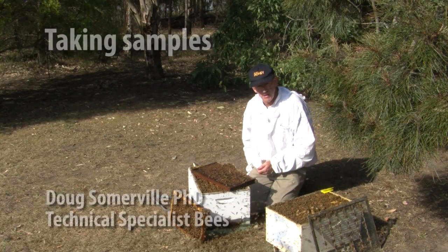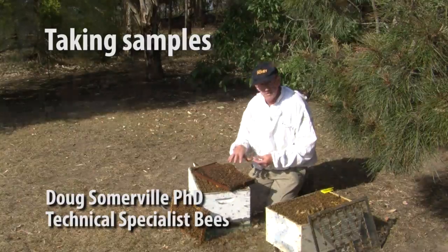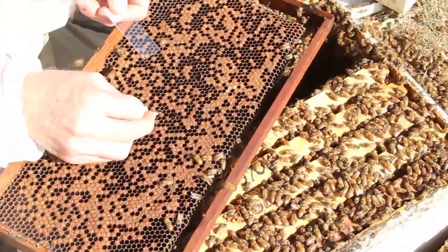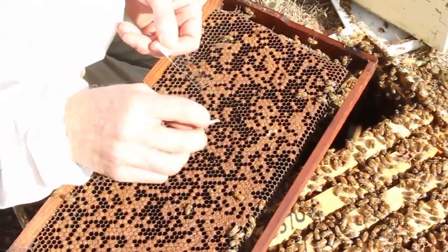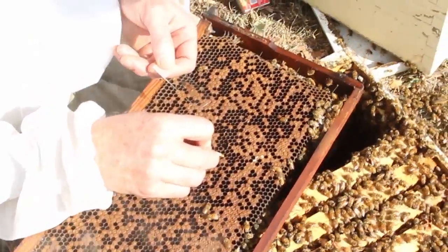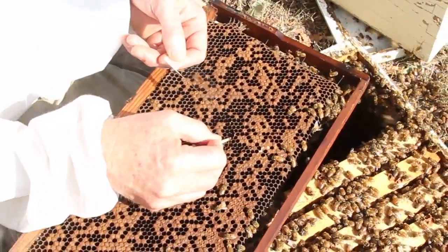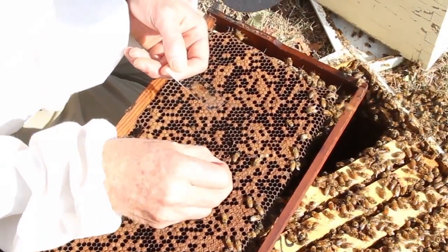We've found something suspicious in a beehive. What we need to do is ascertain whether it actually is American foulbrood, or it could be European foulbrood, or it could be a virus. One of the methods of doing that is to take a smear sample or a smear slide, and we get three or four contents of decayed larvae and put it on the slide.